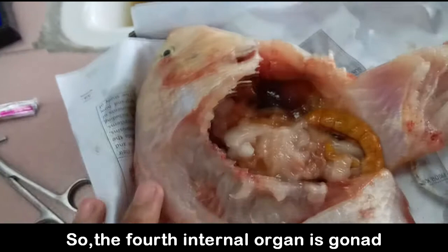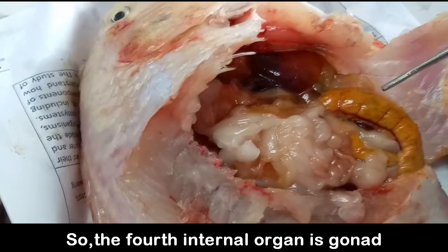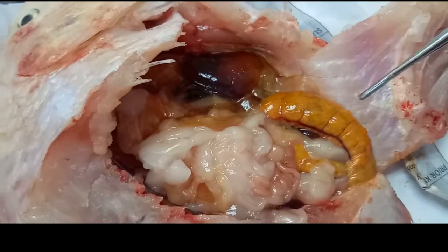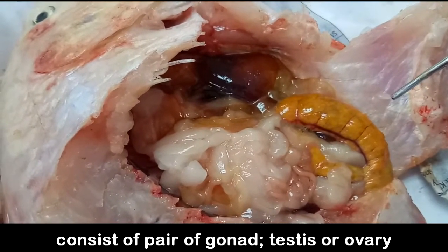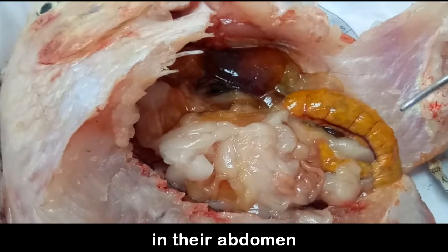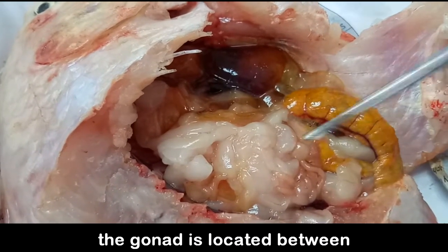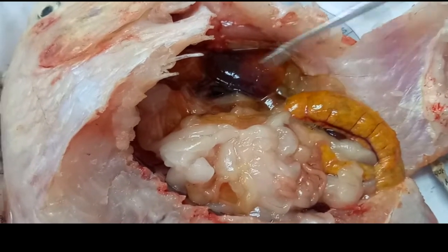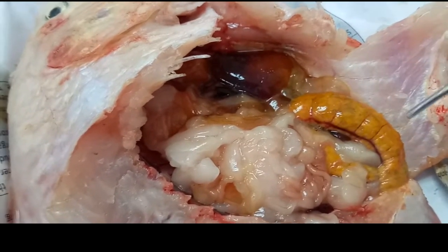So the fourth internal organ is the gonad. This is the gonad. It consists of a pair of gonads, testes or ovaries, in the abdomen. The gonad is located between the intestine and the swim bladder. So this is one. Alright.